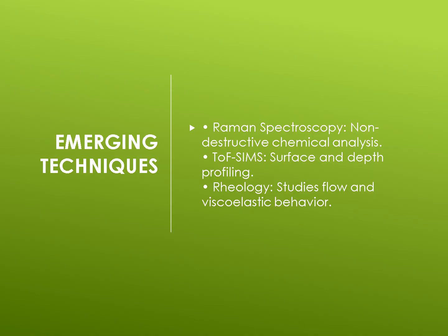Polymer analysis continues to evolve. Techniques like Raman spectroscopy allow non-destructive chemical mapping, while time-of-flight secondary ion mass spectrometry, TOF-SIMS, gives precise surface composition and depth profiling. Rheology is another growing field, studying how polymers flow and deform under stress. These advanced methods give us a deeper, more dynamic view of polymer behaviour, paving the way for smarter material design.